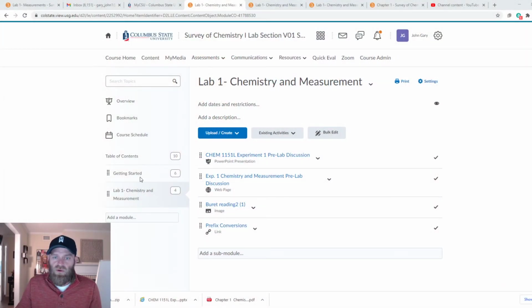So what we typically do is I'll go through all the technical stuff, how you're going to operate online, and then Jamie or another student will perform the lab on video, and then you'll act like you're there, right? You'll watch the video, pretend like you're in the lab doing the experiment. Now, for this week, we're just doing measurements, so it's not quite the same, all right? So let me look at what we got going on in Cougar View, explain how this will all work, and then get you started on lab one.